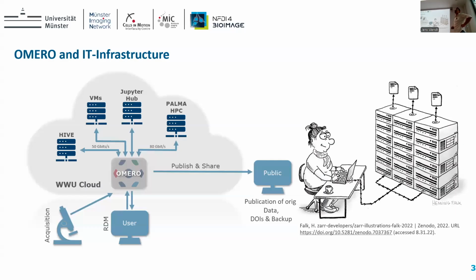I guess if you're using software where Omero is integrated, and you then browse through Omero and say there's my data, if it then goes directly to the data or via Omero to the data, I'm not sure about it. It goes by Omero, okay. So there is a possibility to access this directly. We haven't done it yet because we don't want to touch the files in the Omero dir.